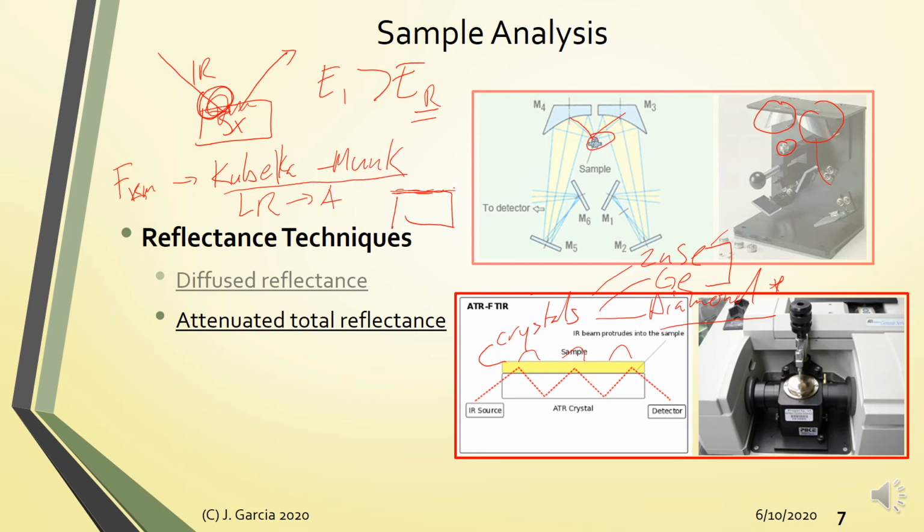So the principle here is based on attenuated total reflectance, wherein in the absence of the sample, infrared radiation will repeatedly bounce, depende dun sa type of crystal. This is a multiple bounce type, but there is also a single bounce type na tinatawag. Yung sa Adamson na lab is a single bounce type, so meron kang isang circular na crystal.